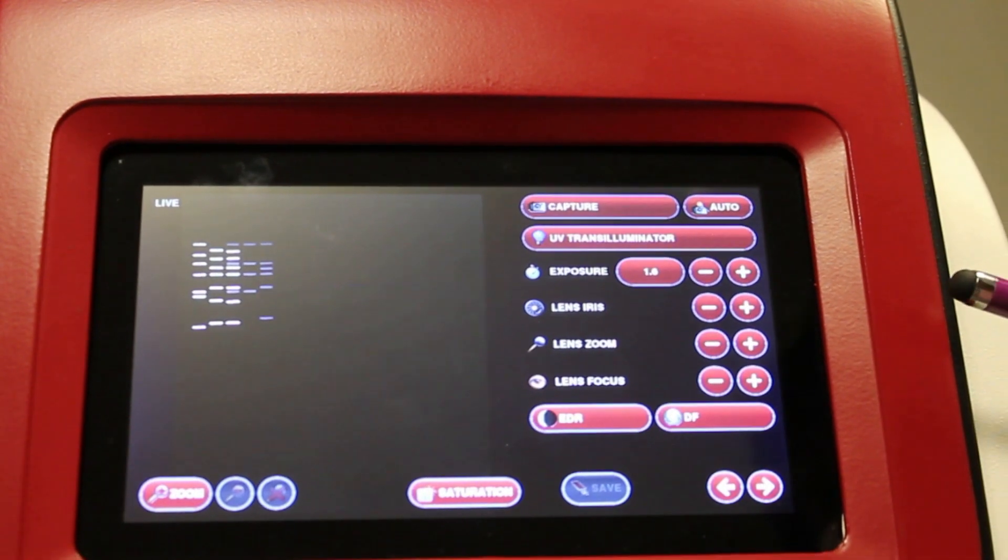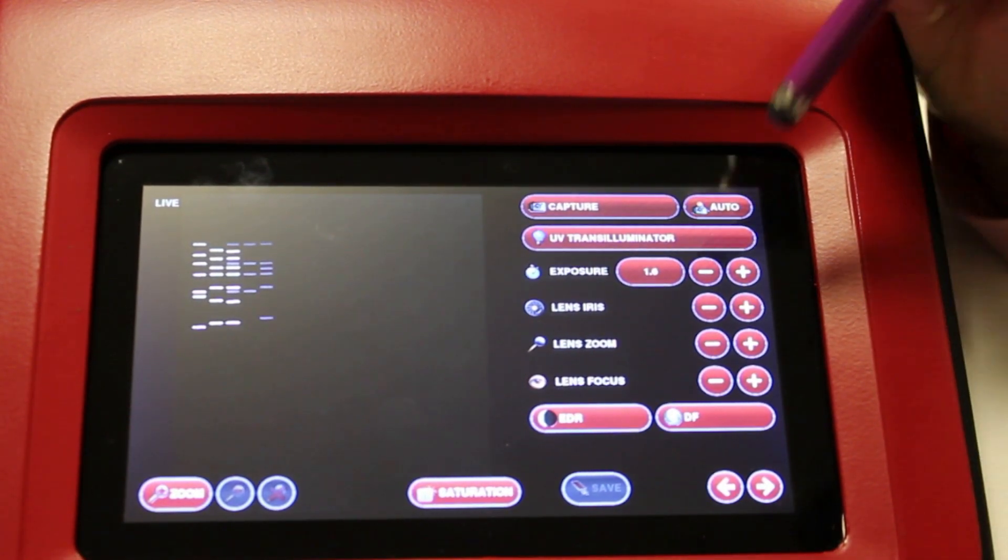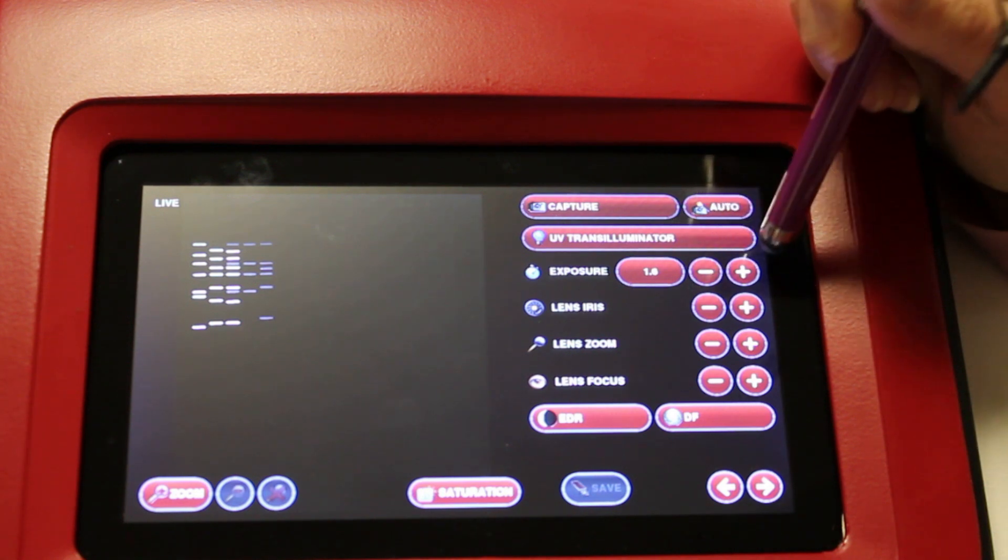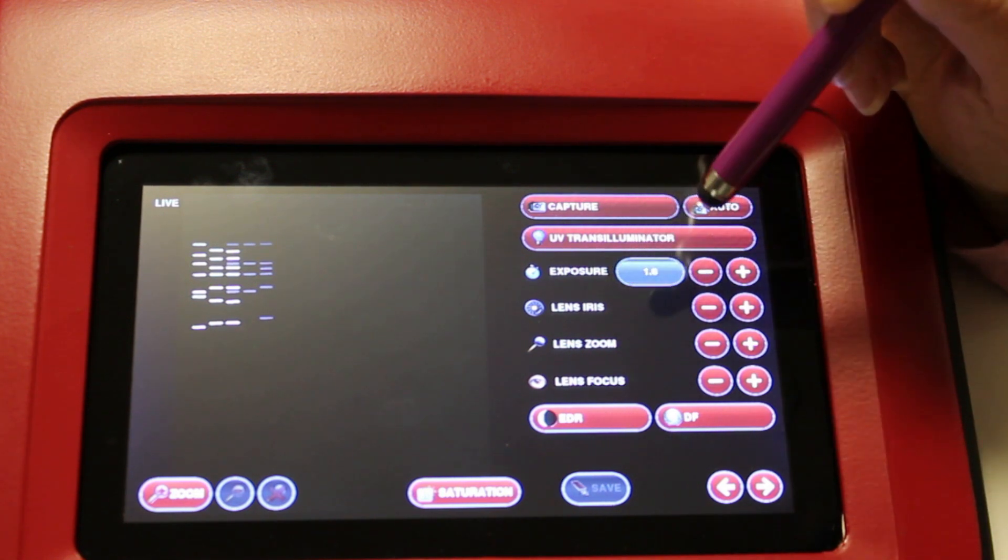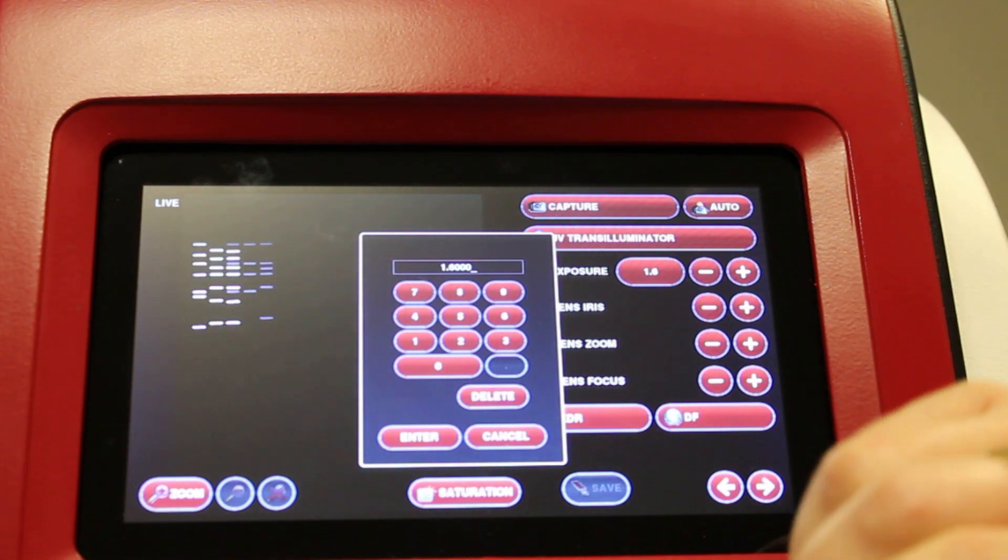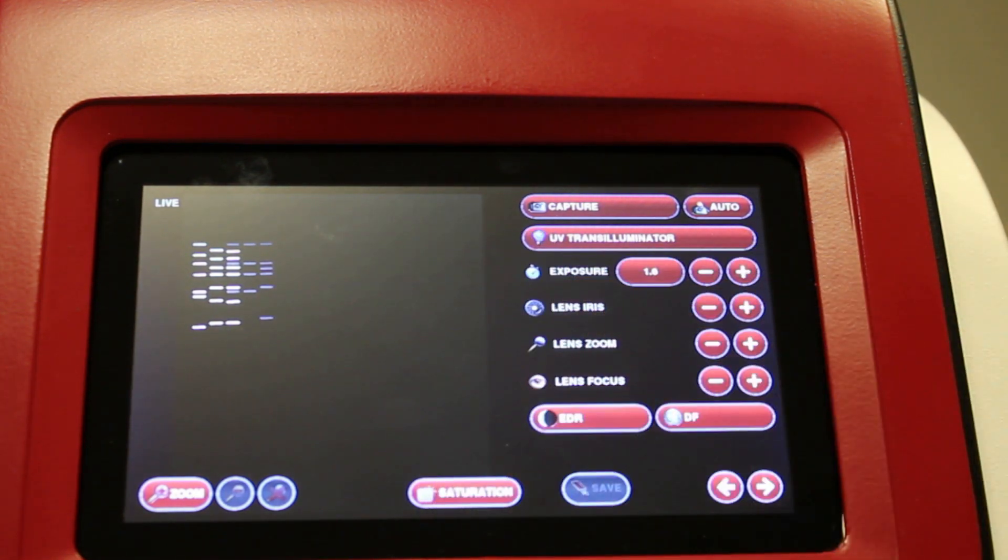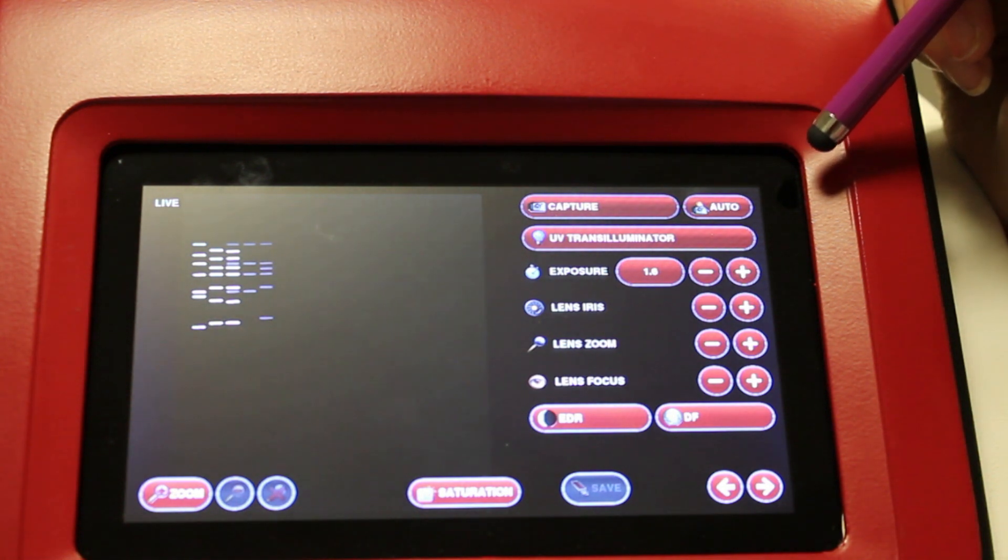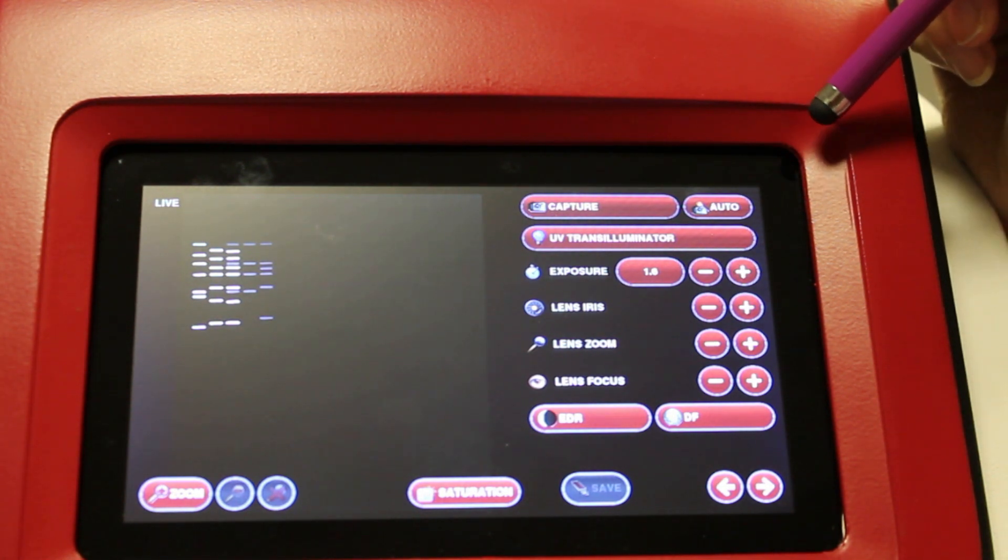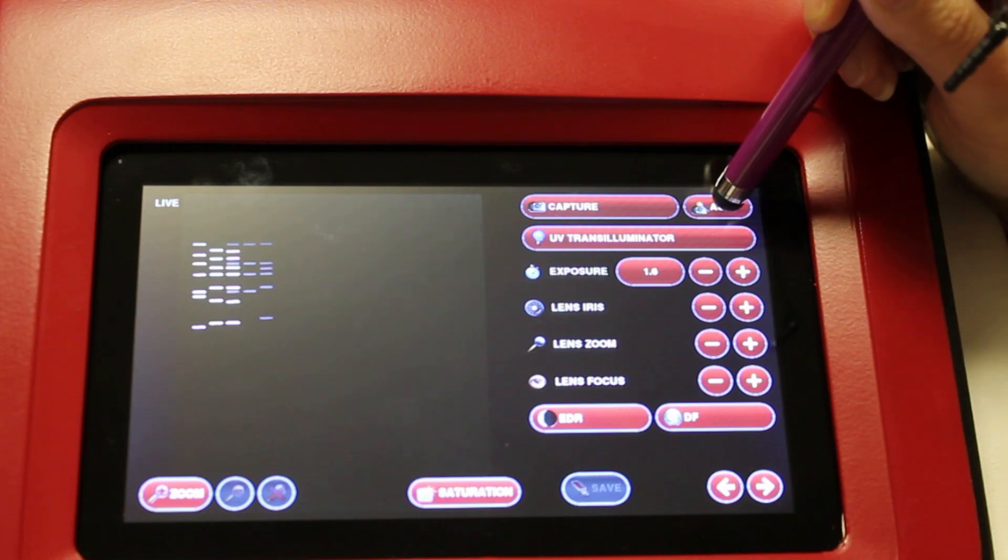Within the Neugenius software, there are two ways to set the exposure time. You can use the plus or minus buttons here, or you can manually type in an exposure time using the on-screen keyboard. You can also allow the software to automatically calculate the best capture time for you using the auto button here.